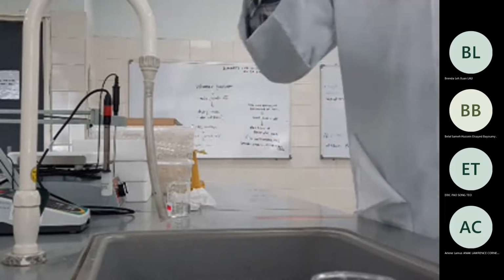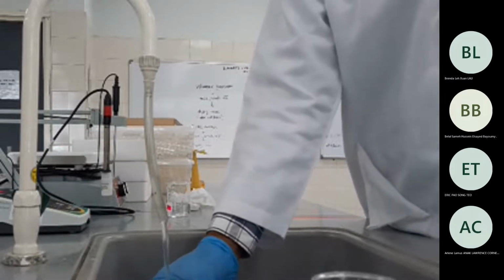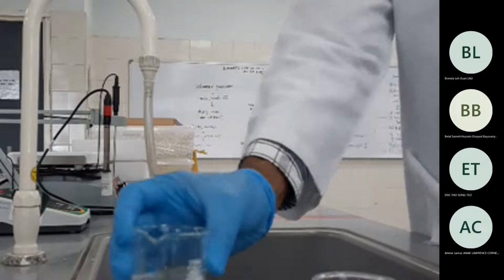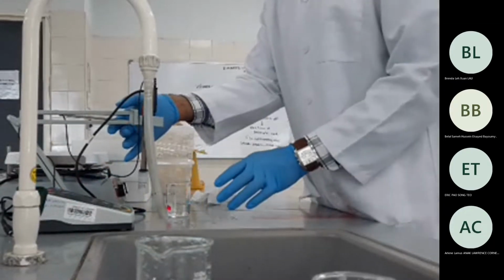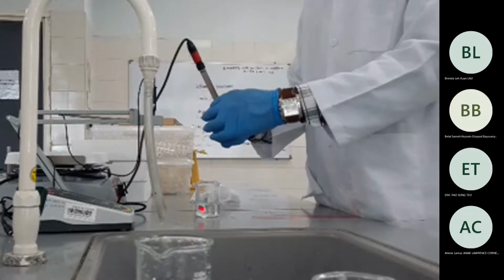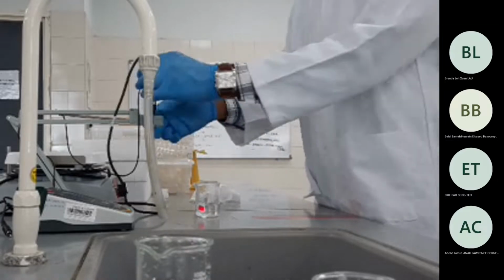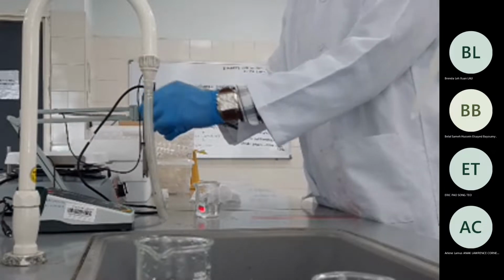So is it clean? So before we start the lab today, for the second experiment, what we will do is determine the pH for the distilled water that we are using today in the lab, and also the pH of the tap water.